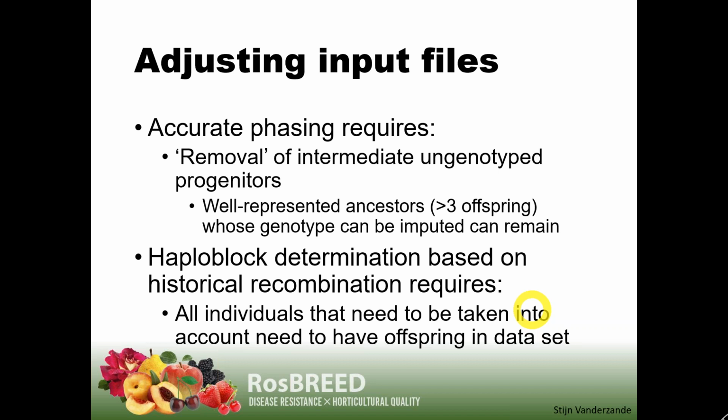Then secondly, visual FlexQTL needs to know which individuals are important and which ones are not. So which ones are, in our case, selected material, and which ones are not. We probably, if you know your germplasm, can just see by name which ones are cultivars or selections and which ones are just seedlings, but visual FlexQTL cannot. And unfortunately, there's not an easy way where you just add a parameter to the file listing which ones are selected or not.